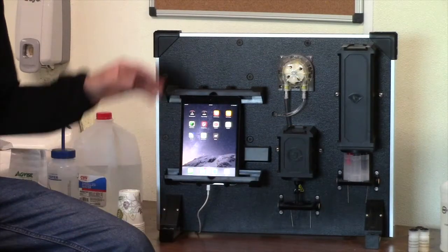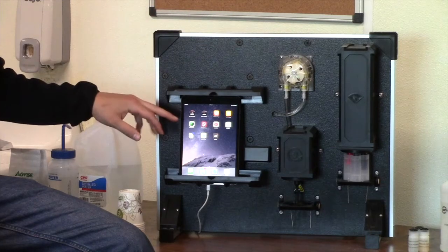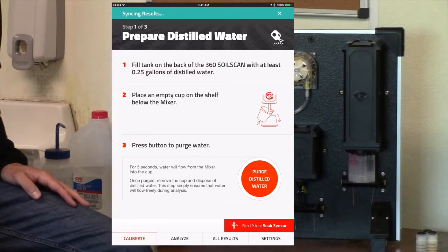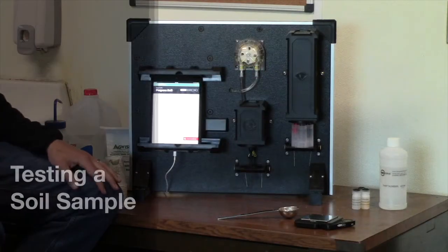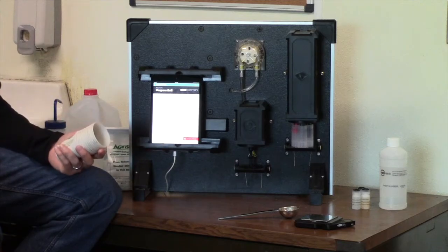The next step in preparing your 360 soil scan to take a soil sample reading is to open up the 360 soil scan app. The first page will walk you through what you need to do to prepare your soil scan. Now that our soil scan is prepared, we can begin testing soil samples on our machine.